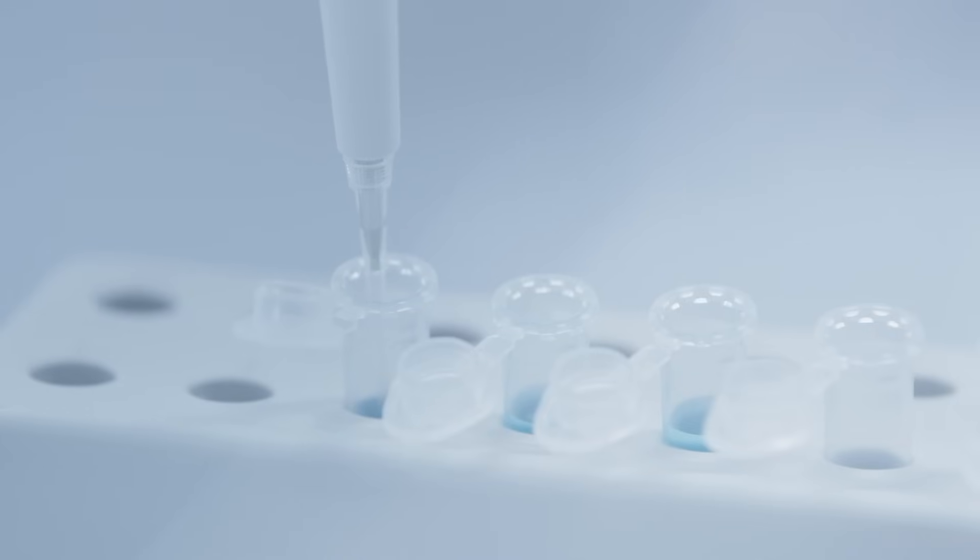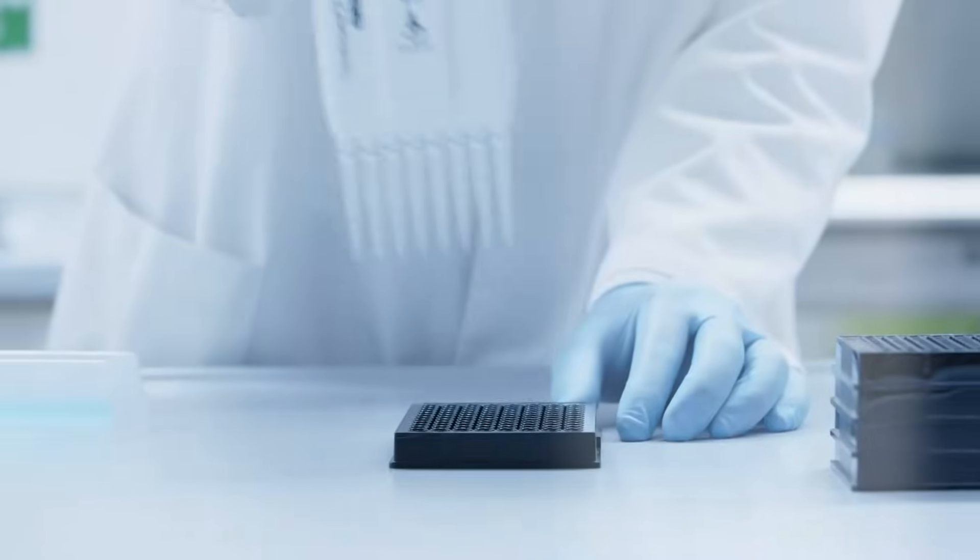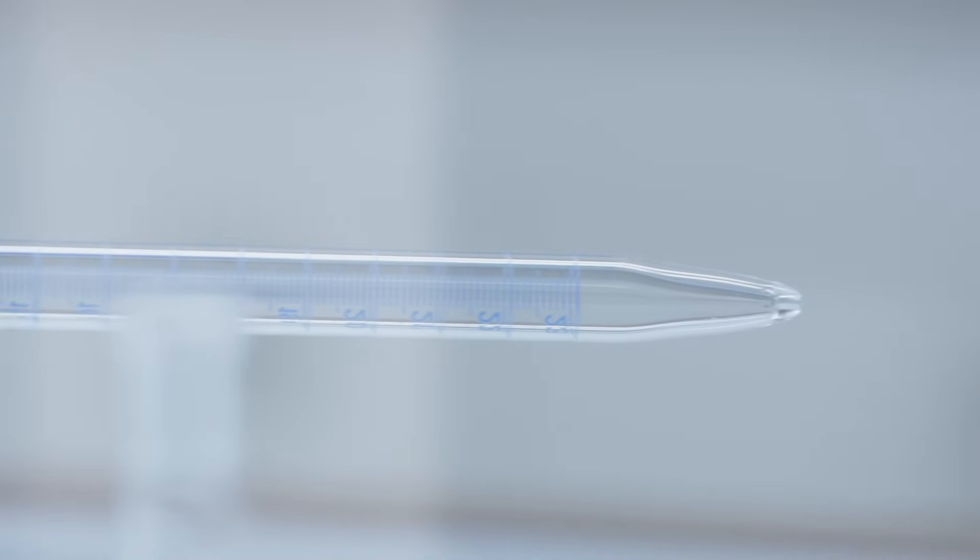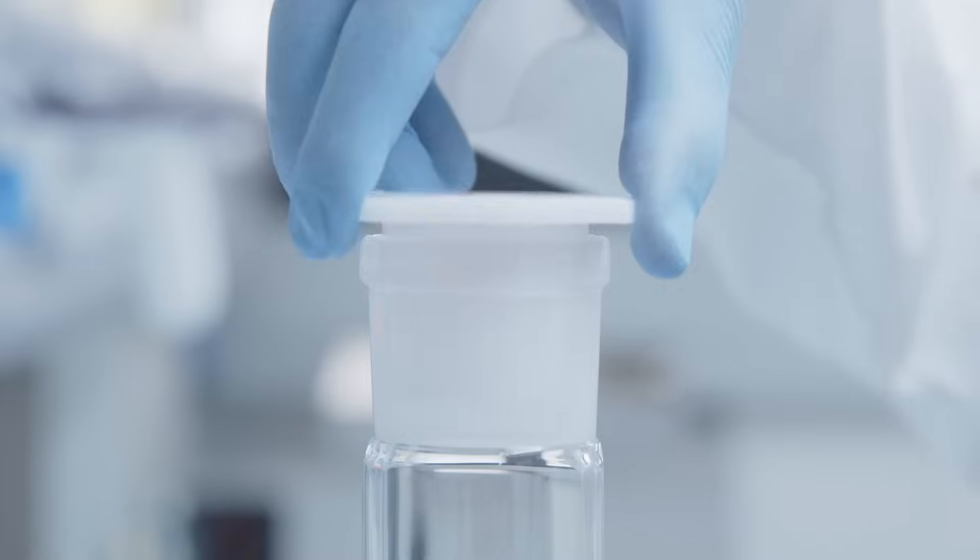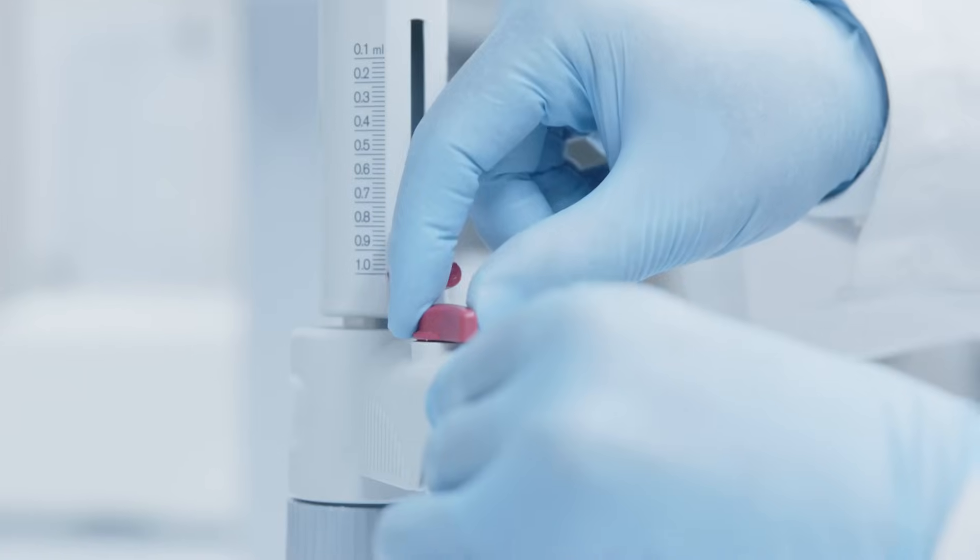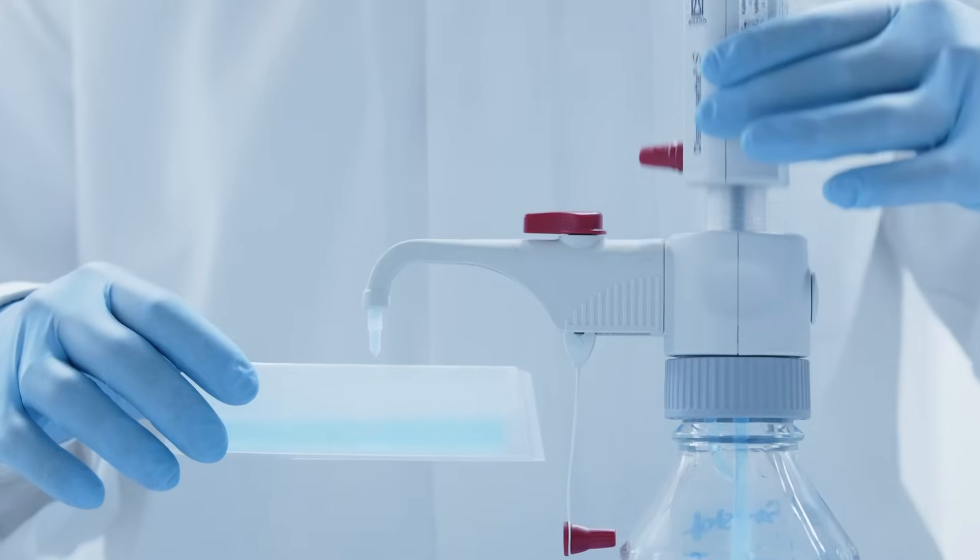From life sciences to chemistry, from 0.1 microliters to 10 liters, all with one goal: you can focus completely on your analyses, research, and results.